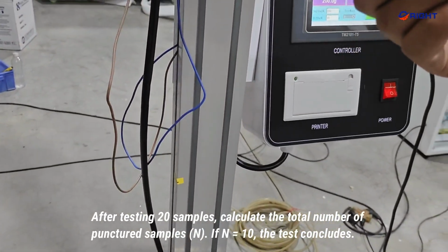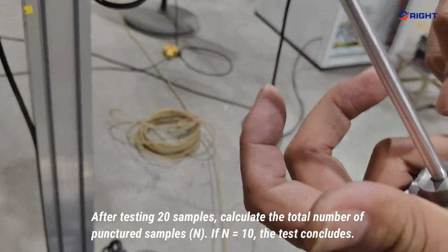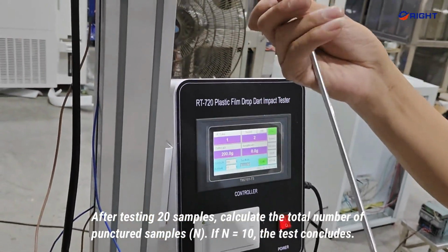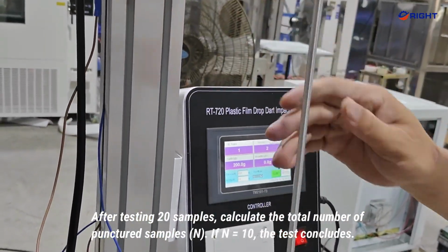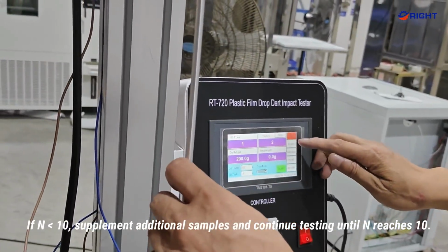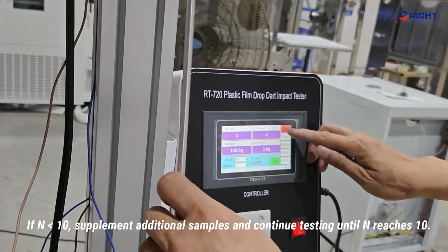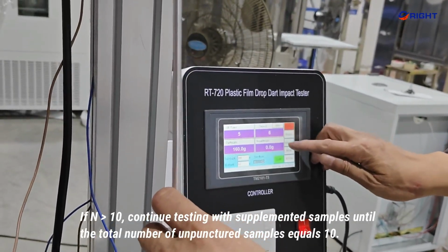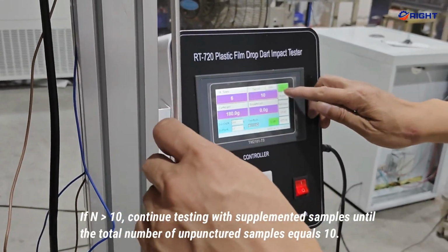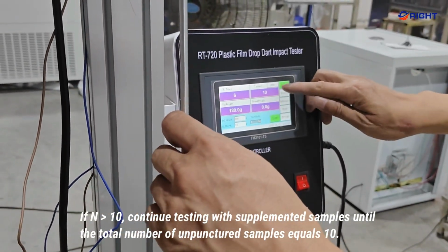After testing 20 samples, calculate the total number of punctured samples, n. If n equals 10, the test concludes. If n is less than 10, supplement additional samples and continue testing until n reaches 10. If n is greater than 10, continue testing with supplemented samples until the total number of unpunctured samples equals 10.